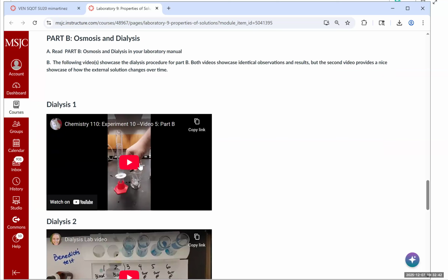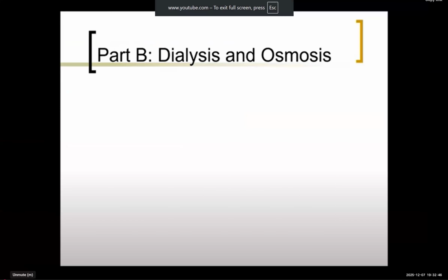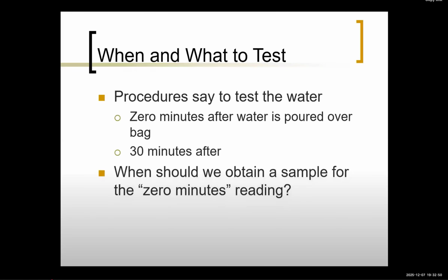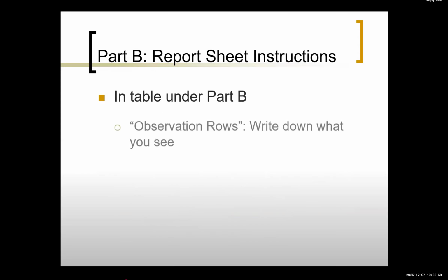So here's the dialysis. Let's watch this video in detail. I would encourage you to watch this video on your own time with the narration on, as it has a lot of useful information. We're going to skip ahead to when they actually start performing the procedure.